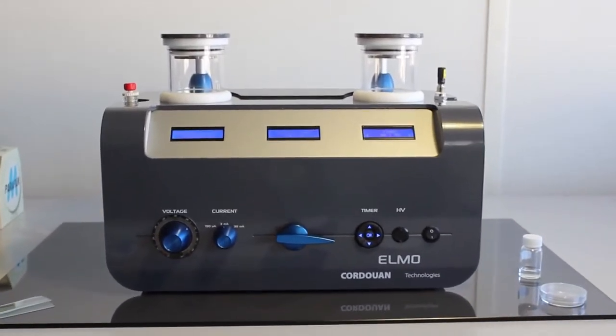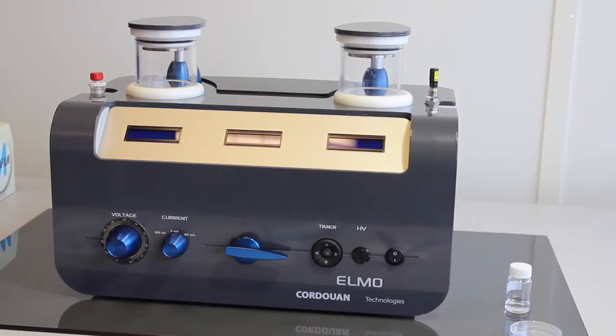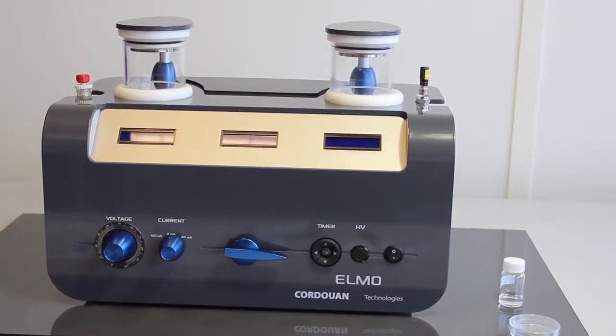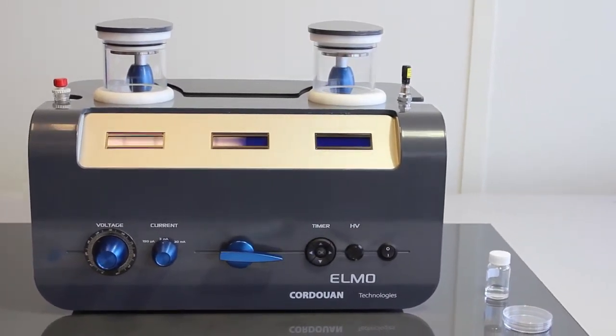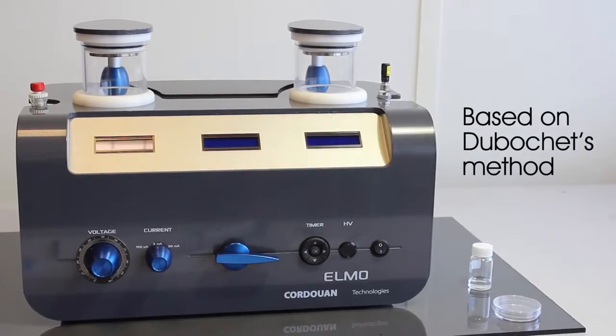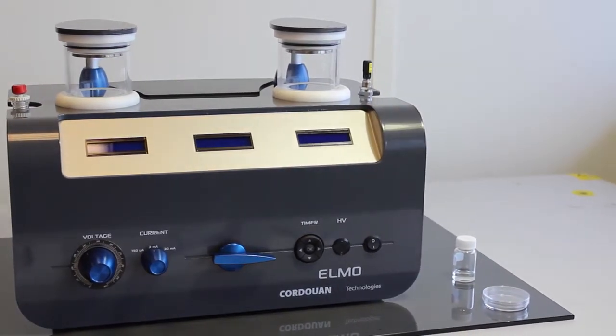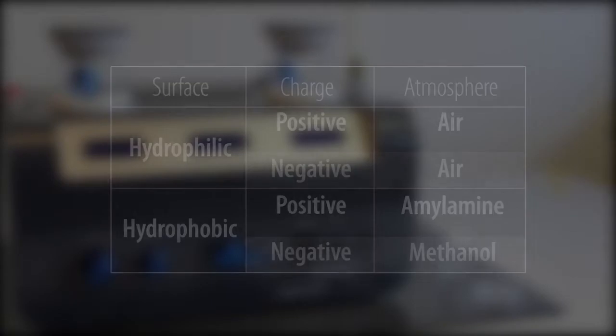Cordouan Technologies is pleased to introduce its Glow Discharge System for TEM Support Films or Grids, ELMO. Based on Dubochet's method, the ELMO system has been developed in collaboration with the IGBMC and ICS laboratories.